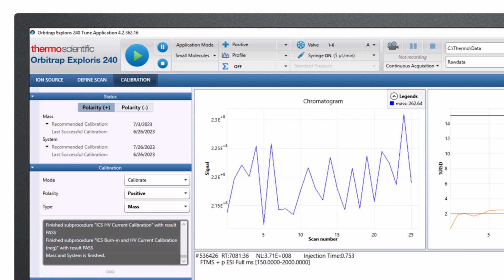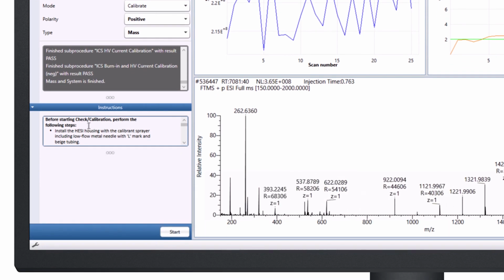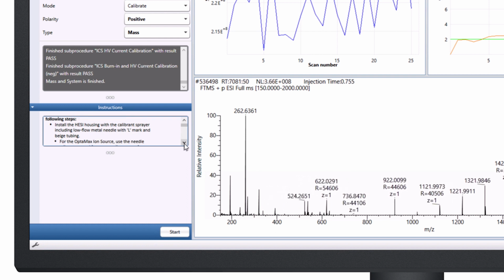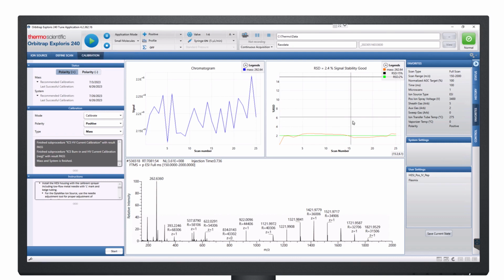Another bonus is that setting up calibration is pretty simple, but just in case you forgot or you want to make sure you're doing it properly, or you're looking at the spectra or the settings properly, take a look at that as well. That's a nice overview of the instrument control software.